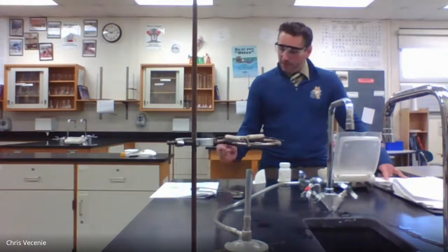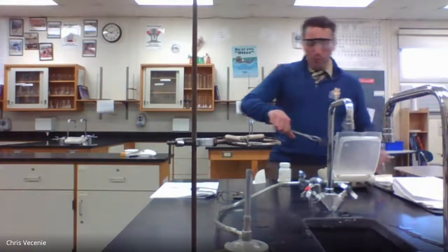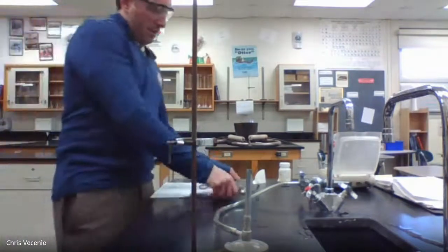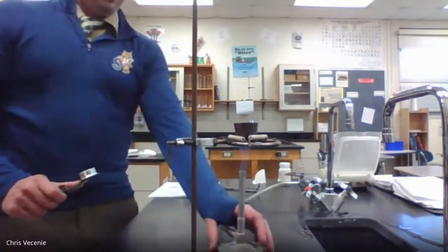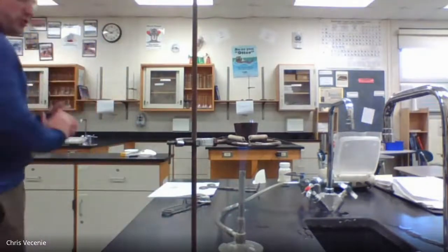All right, step 6, it says move the crucible to the pipe stem triangle, and then lightly heat it for 2 to 3 minutes. And the whole point there is to get rid of any water that may have attached. So I'm going to return it on my burner, put it on there, getting the time on the clock. I'm going to let 2 to 3 minutes go by.